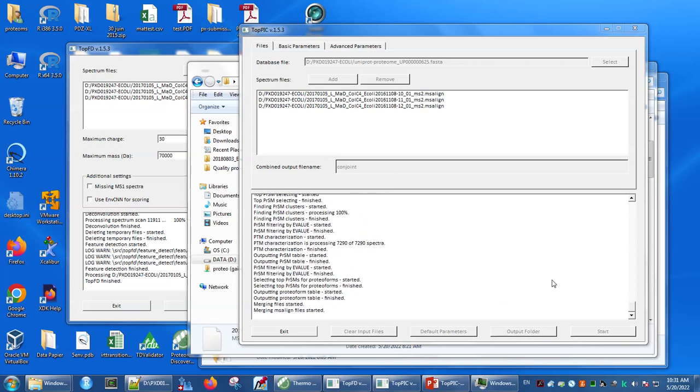As you can see, the searches for each of the 3 files have passed through the no PTM stage, the 1 PTM stage, and then e-value computation. At this point, though, we've moved past the outputs for the individual raw files and are working our way towards a cumulative summary of everything. One of the things that we see is that the MS Align files that we used as inputs are going to be combined together in one big MS Align file that represents everything that was included in the analysis.